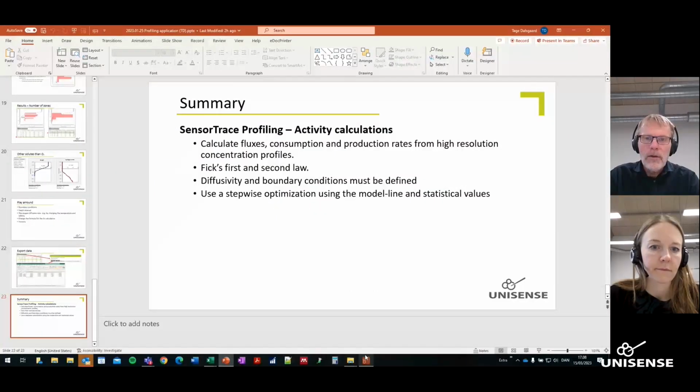There was a question above that one. Will we avoid the data when the consumption of oxygen is higher than production every time? No, I think you can easily analyze the curvature of the profile. So, for example, I'll just share my screen again because I think I could show you the one here.